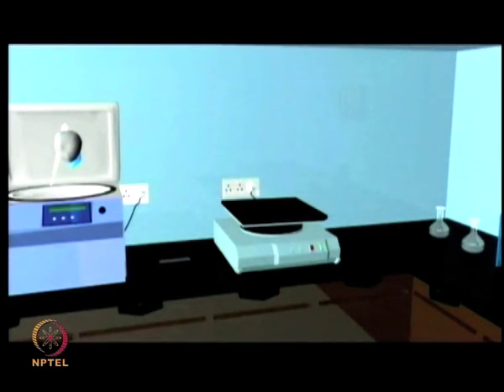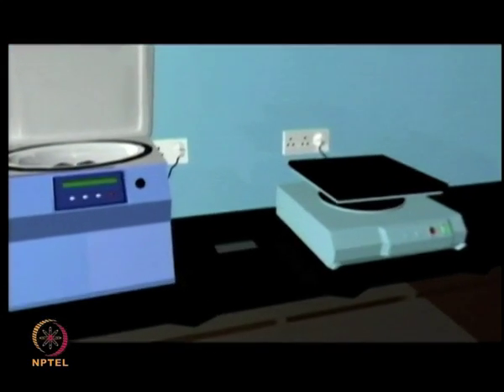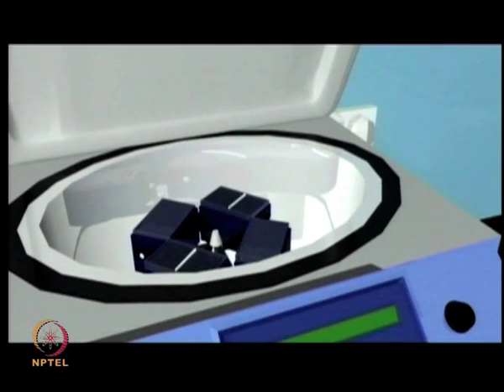After this step, one can add the secondary antibody labeled with either Cy3 or Cy5 conjugate labels, or one can use an HRP based detection system for detecting the signals. But prior to this step, one needs to dry the chip by centrifugation. So, rinse the slides quickly and then centrifuge to dry them, or one can also use compressed air for drying these slides.